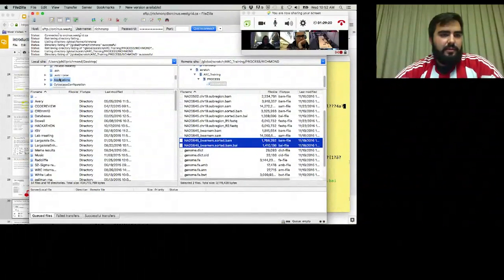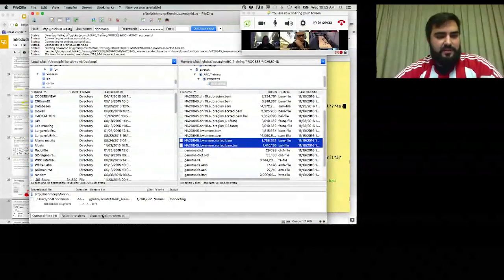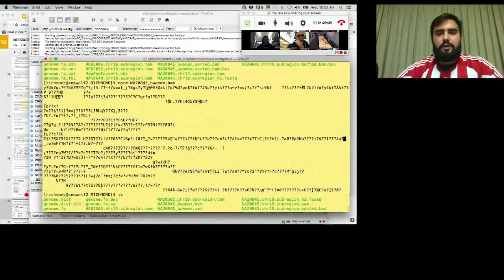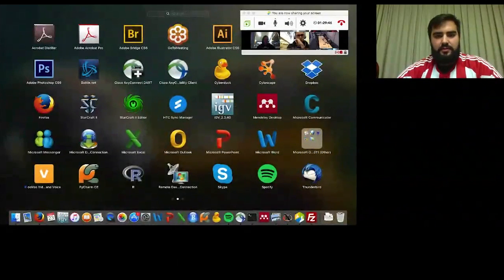I will go ahead and put them into the desktop. And now those are successfully transferred. So now if you've done that, the next step is going to be to open up IGV.